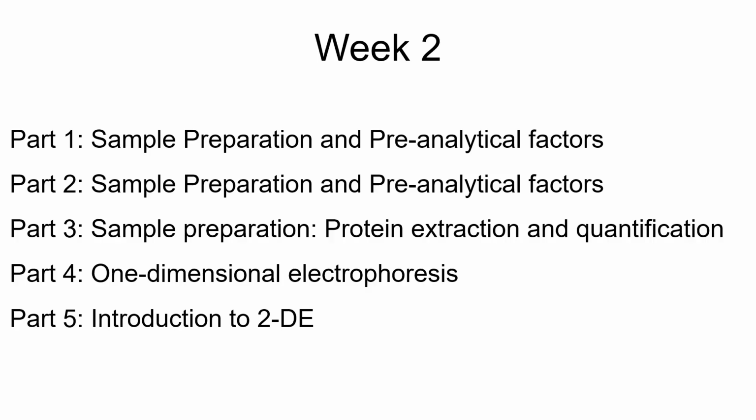Depending upon your aim and the technique you will be utilizing to study that protein, your sample preparation will vary. So in these week 2 lectures, most of the part is related to sample preparation.